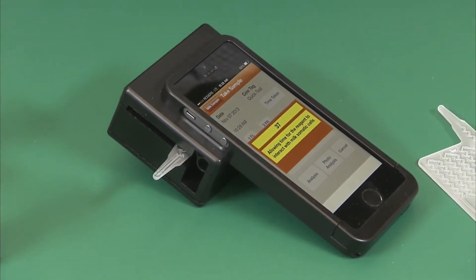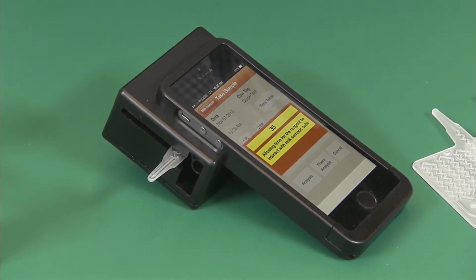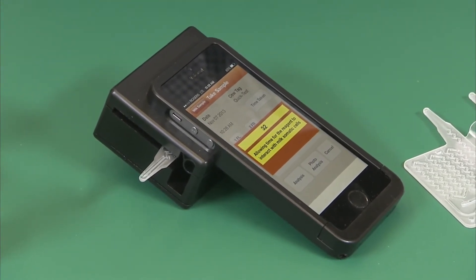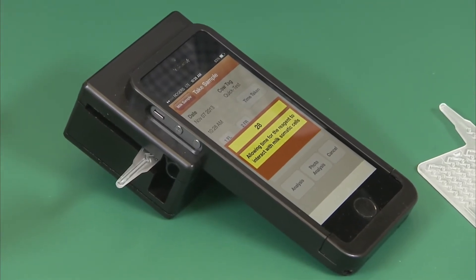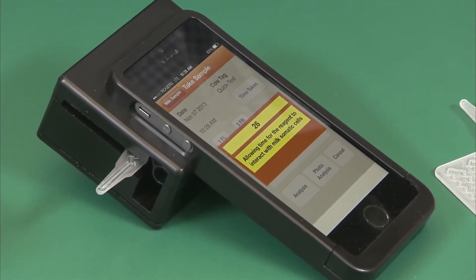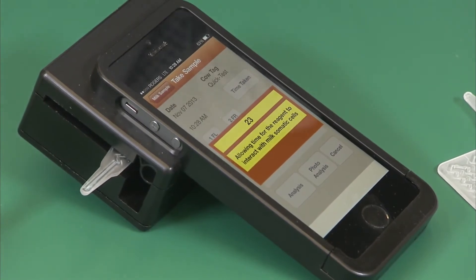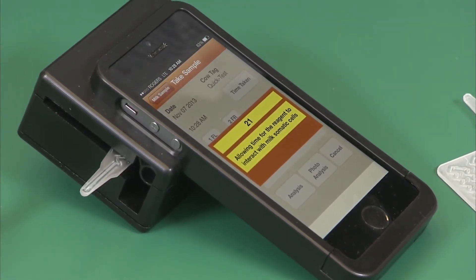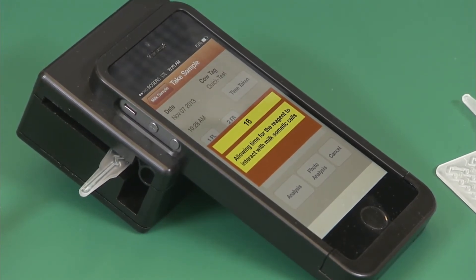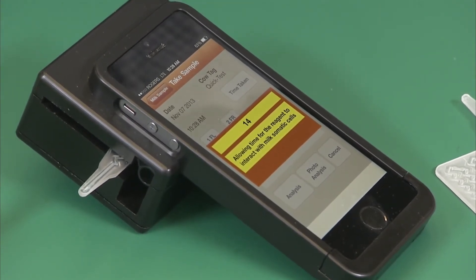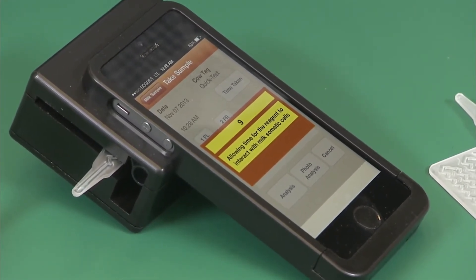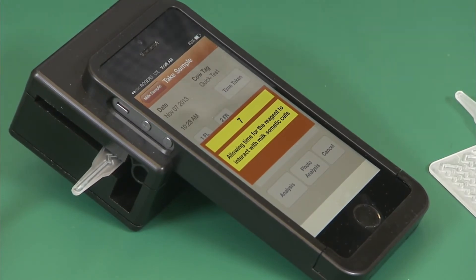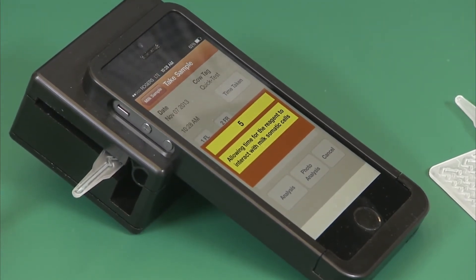As you can see, it's starting to count down now — an incubation period. During this period the chemical will be acting on the milk, and within 40 seconds we'll have maximum fluorescing of the somatic cells, at which time the app will determine the somatic cell count. If the count is high and there is a pathogen present, the app will also determine which pathogen is present in the milk.